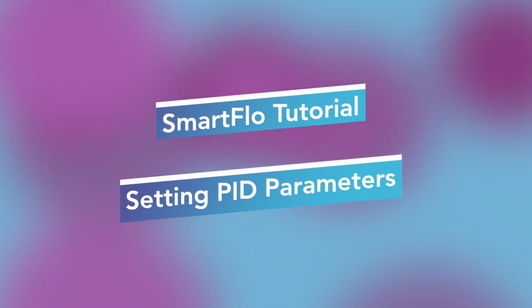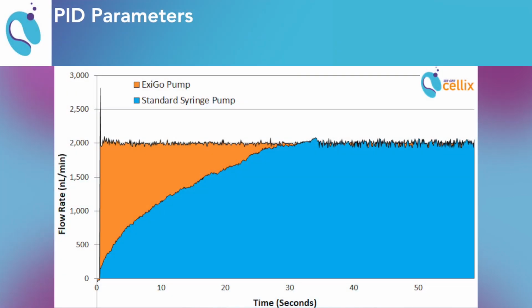In this video, we'll look at setting your PID parameters. Cellix pumps have fast response time and achieve flow rates quicker than other pumps. However, it's not easy to get the ideal response time, so it takes some work and involvement on the part of the user. This work is done in setting the PID parameters, which control how the pump adjusts its flow to the desired rate.